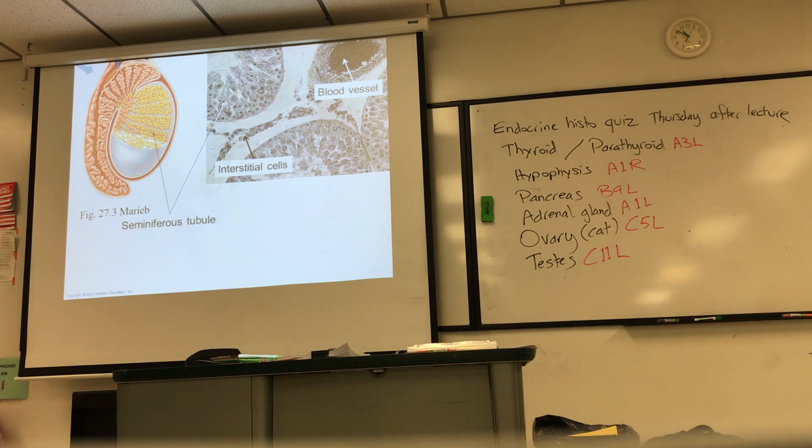Whenever you work with slides, we have lens paper and these little bottles of cleaner here. It helps to wipe down all the dust off. If you didn't take micro, you didn't do much histo in 430, you should put the slide on the stage so it stays still.